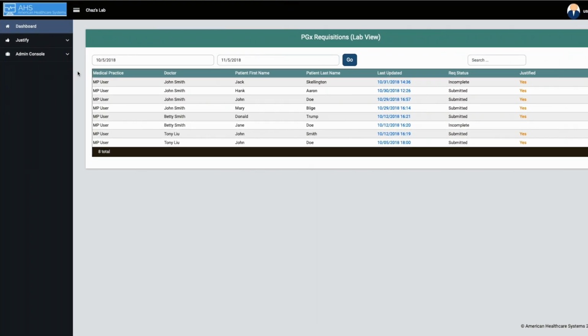Welcome to the Justified dashboard. The purpose of this video is to go over lab user setup.